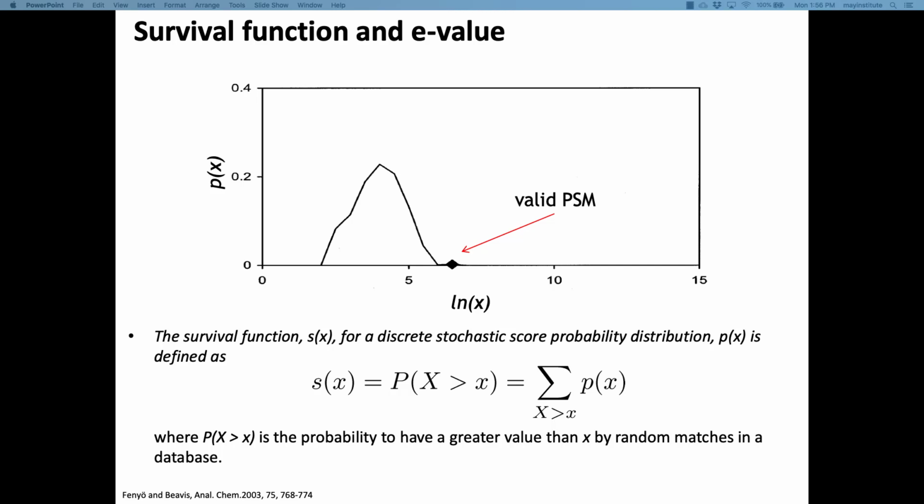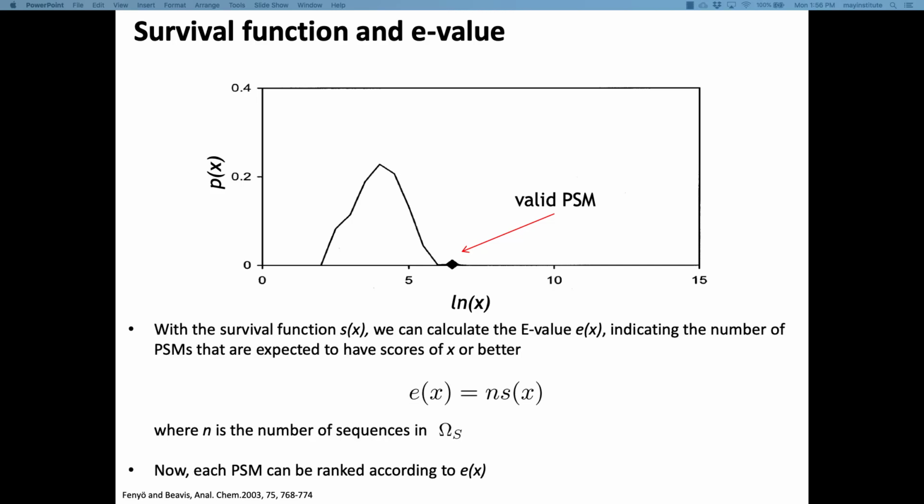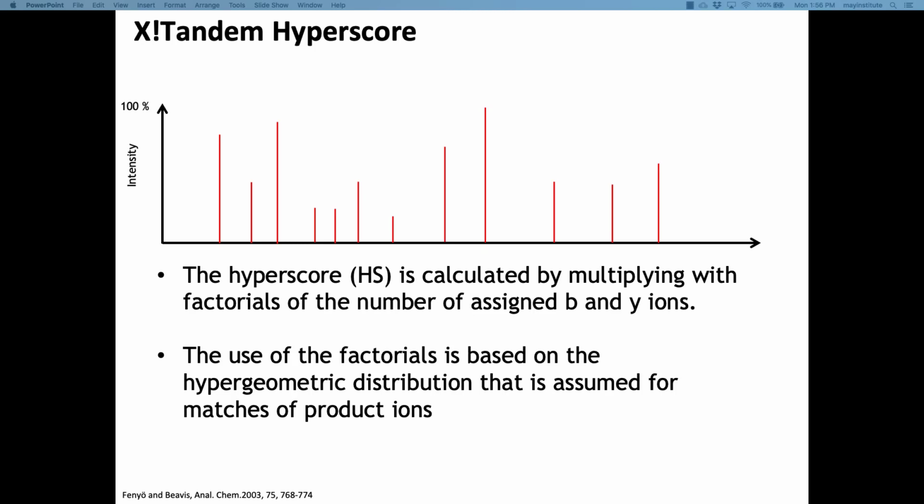And you would hope that if you have scores that give you a very high value, you can trust that more than lower scores, which is not always true. Can you imagine why lower scores might occur and why that might be confused with another peptide? What are the effects that can happen there?